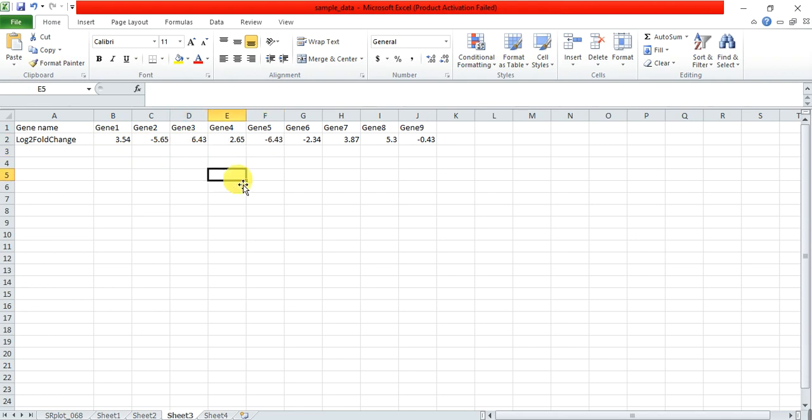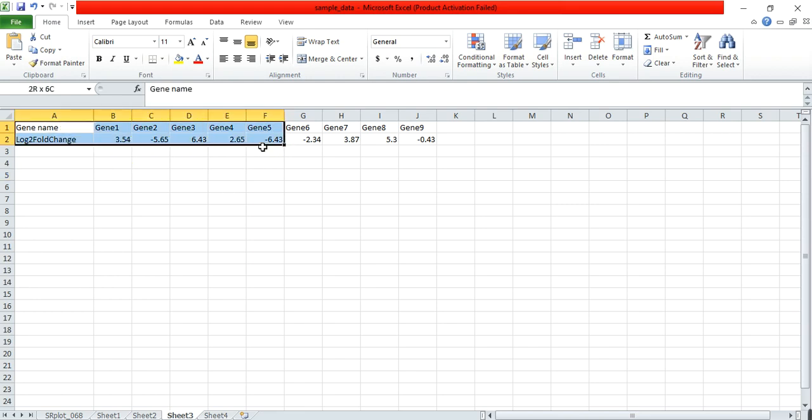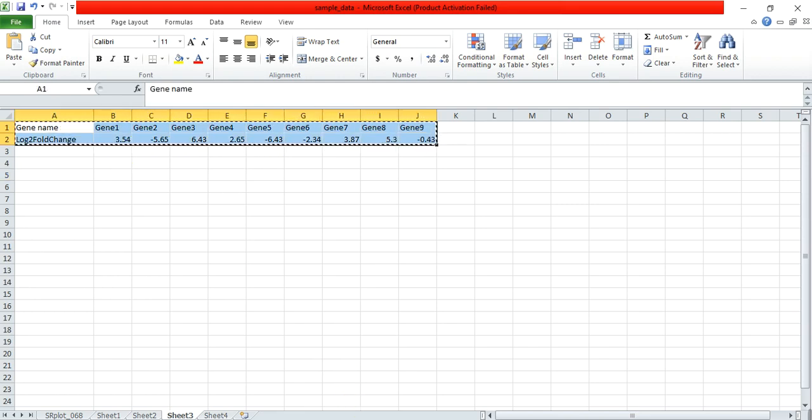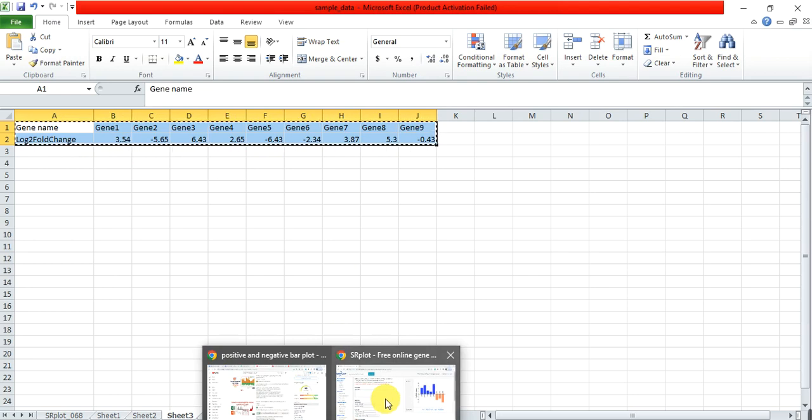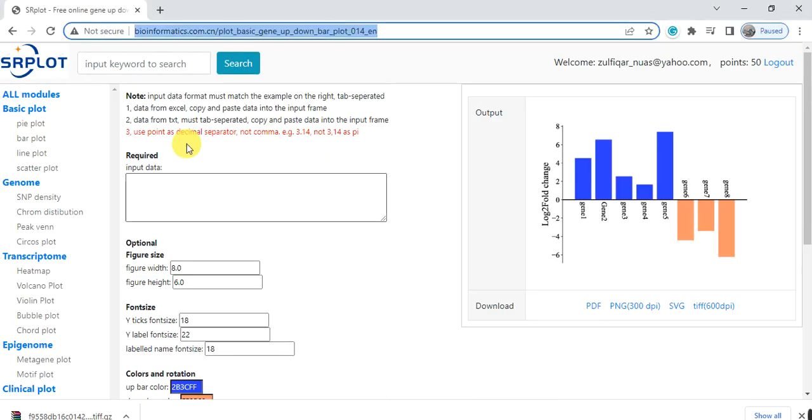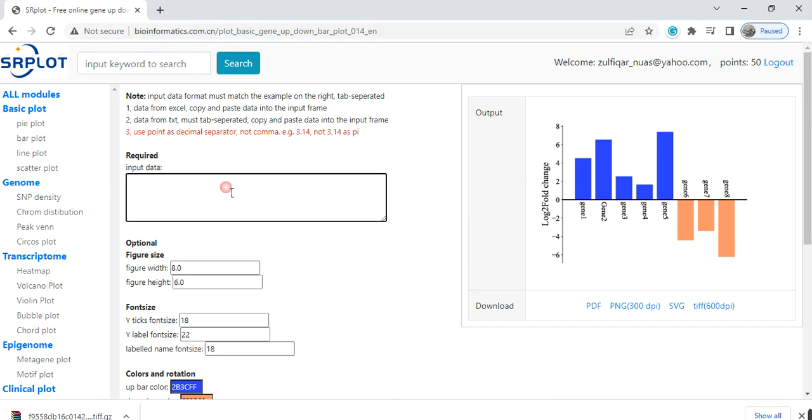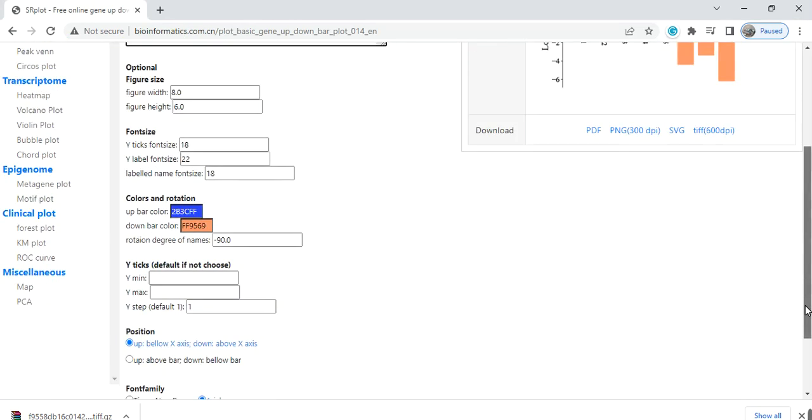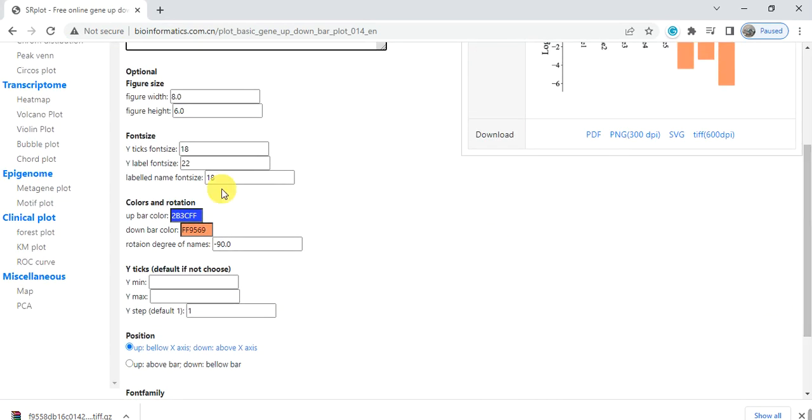So we first need to copy this data and then go to that bioinformatics website. The link of that website is present in the video description. You can find it and then paste your data in the box. Here you can change the graph width, length, and you can increase the size of the fonts for X and Y axis.